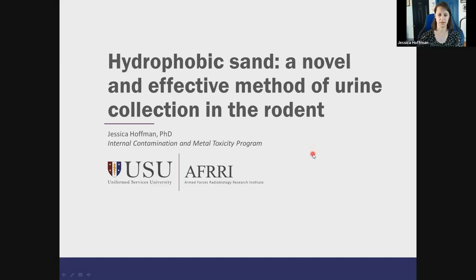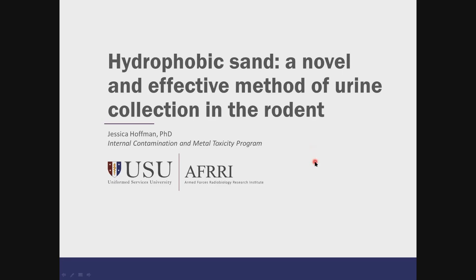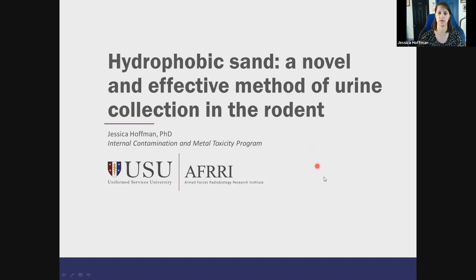Thanks, Eric. Can everybody hear me okay? Excellent. So my goal today is to tell you about this hydrophobic sand as an alternate method for urine collection compared to metabolic cage. I'm going to start with putting it in context of the bigger work that we do, give you a background on what we actually did to compare the two methods, and then put it back into the context of what we're doing now and what we've learned from using it in an actual experiment.